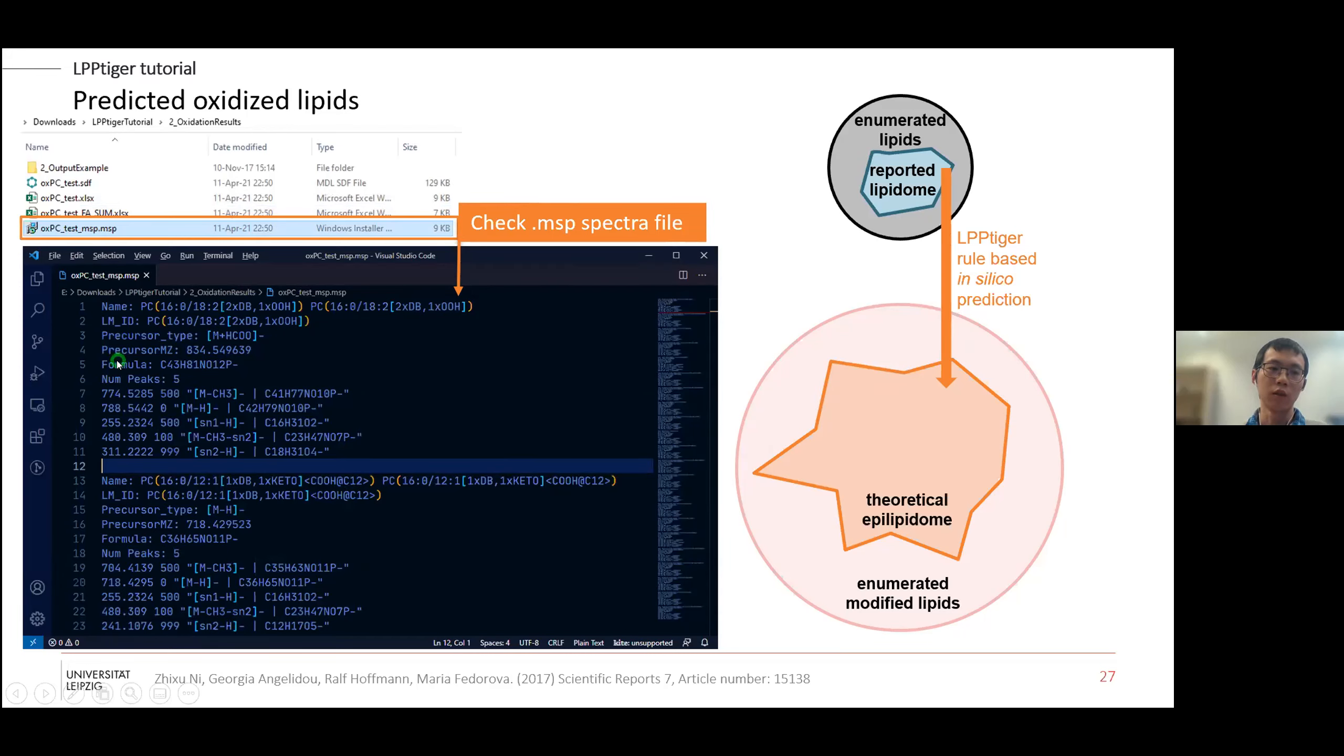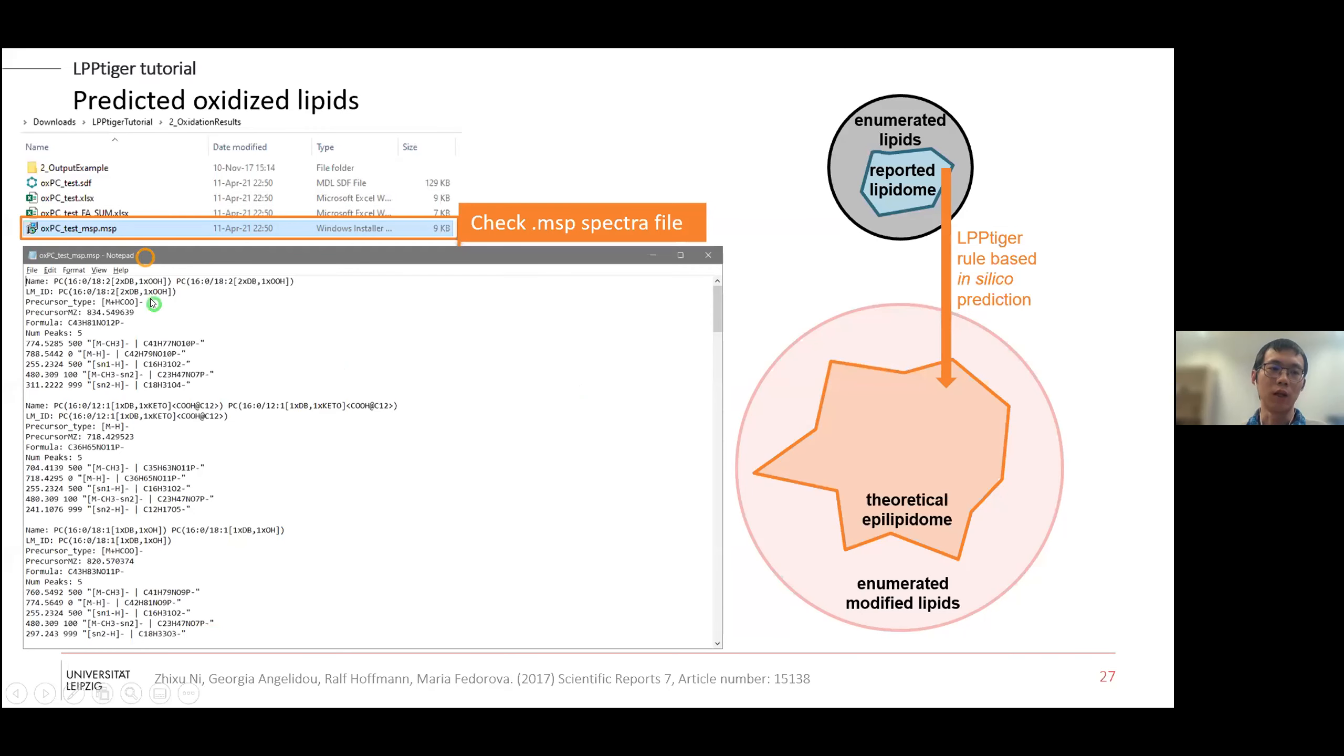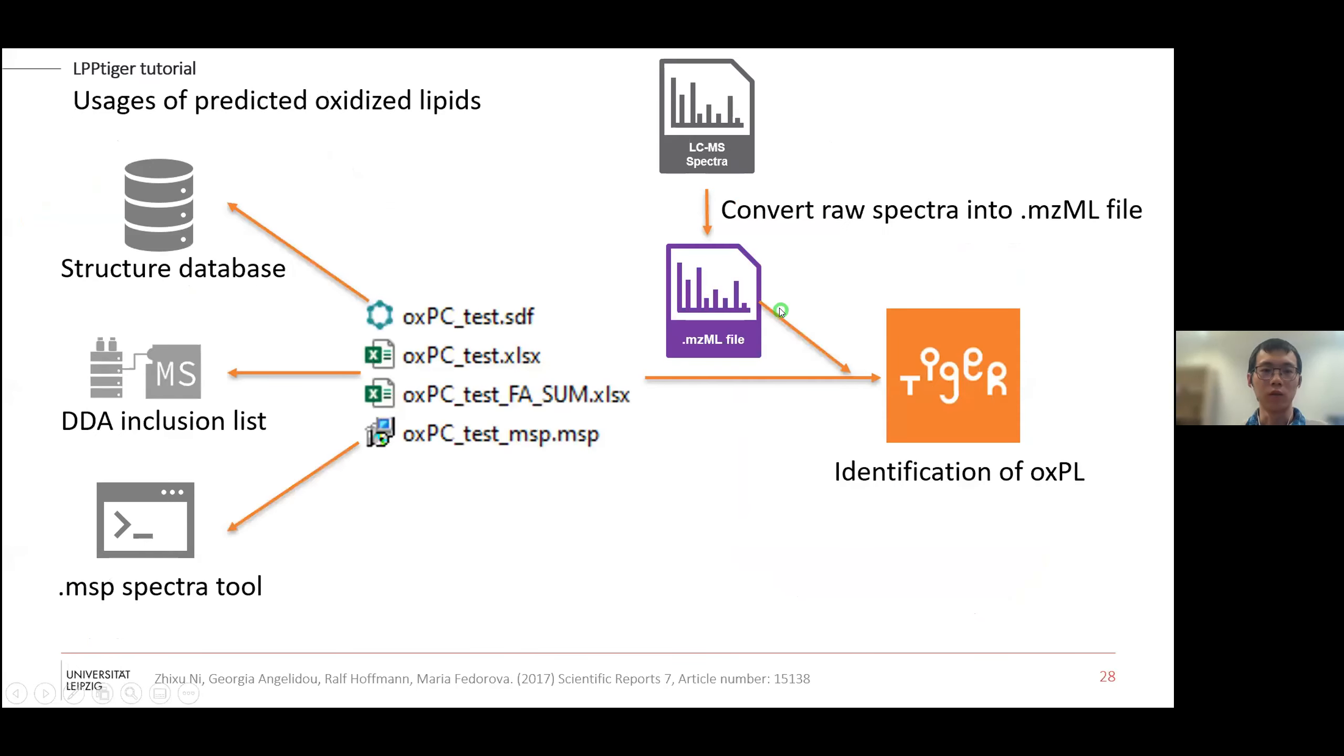We also generate additional files - the MSP library. It basically consists of the precursor type, m/z, formula, and m/z of the fragments, and the intensity, and also some remarks. This is for you to easily look at it. You can open it by any text editor, for example Notepad or other MSP compatible software. These are the four major predicted outputs. You can use SDF files from a structure database. You can use these two files to generate the DDA inclusion list for later analysis, or you can use this MSP file for other compatible software. You can also use these two files for later identification using the raw spectra, which converted to MZML spectra.